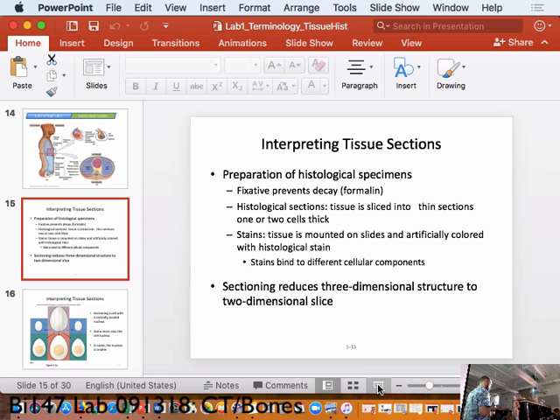But the key one is bringing it up to the lens by looking not through the lenses, but looking just at the slide itself in the real world. And then when you look through the lenses, you dial it towards you, so you're bringing it down. All right?